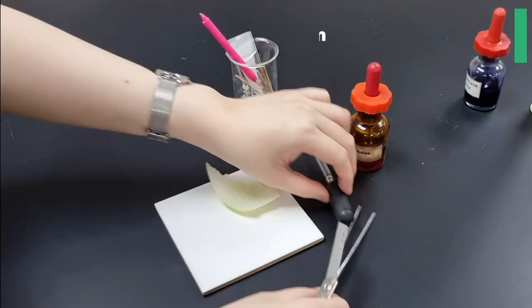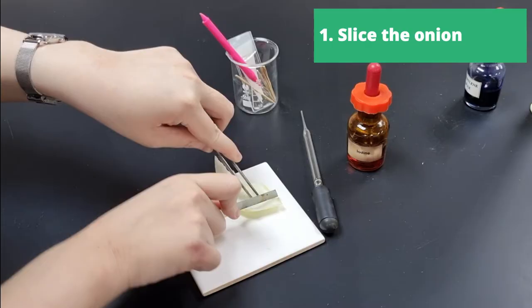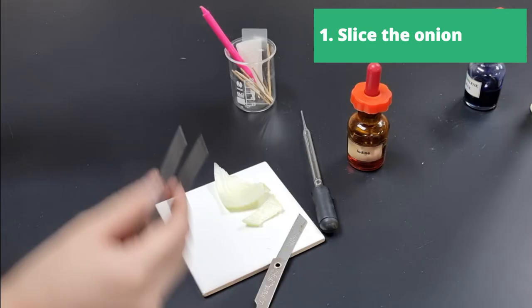Hello everyone, and today we'll be taking a look at some onion cells under the microscope. First we're going to take a little blade and we're going to cut a small section of the onion off.